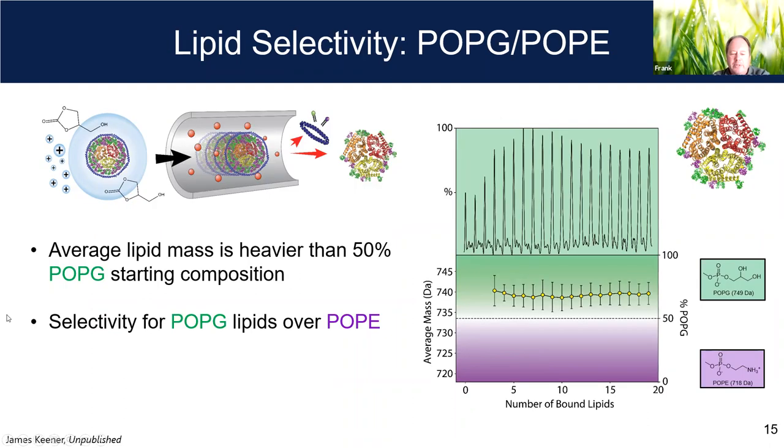Can I ask a quick question? I don't want to butt in, but is the annulus the size? How many would you expect that fit around it? About 80 lipids. Oh, many more. Yeah, many more. And we'll see an example here in a second. This is done with basically just ejecting down to the last most tightly bound set. We do see that the distribution even continues.